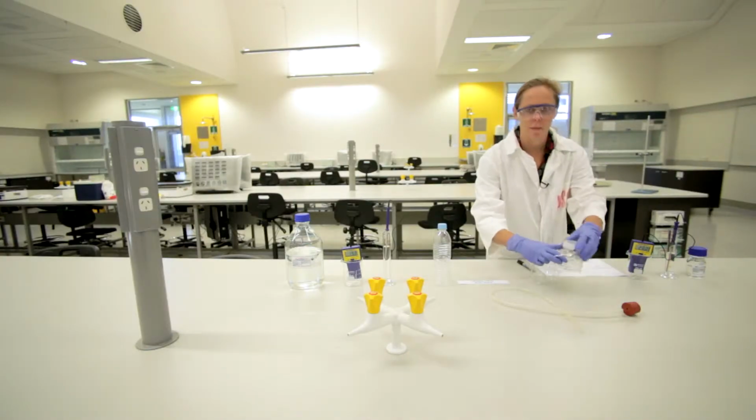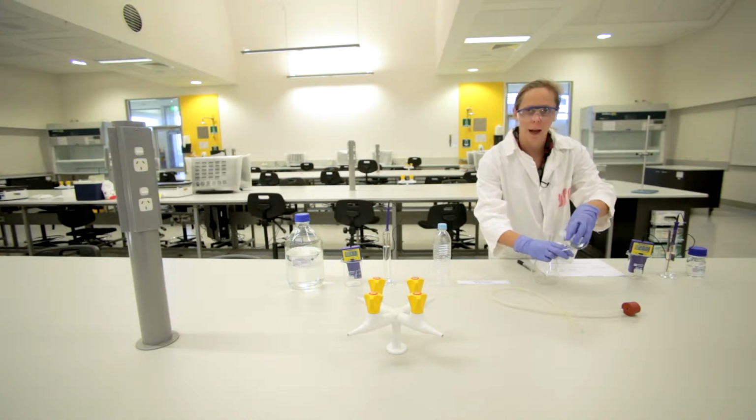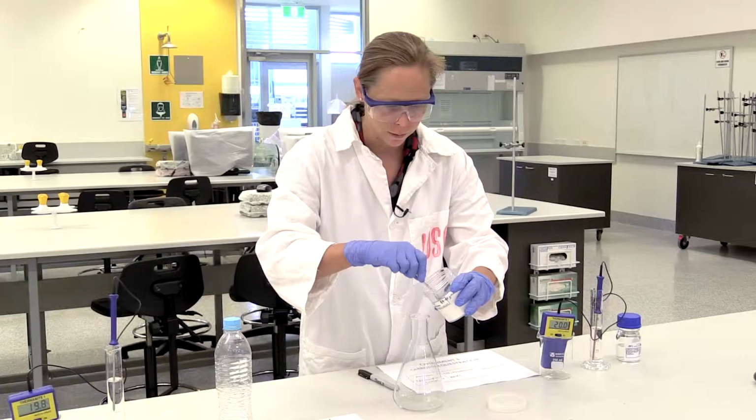Okay, so once again I'll add my 6 spoonfuls of sodium bicarbonate to the conical flask.